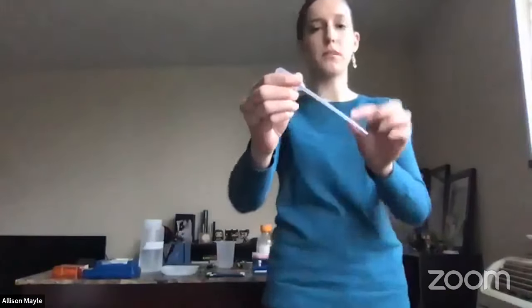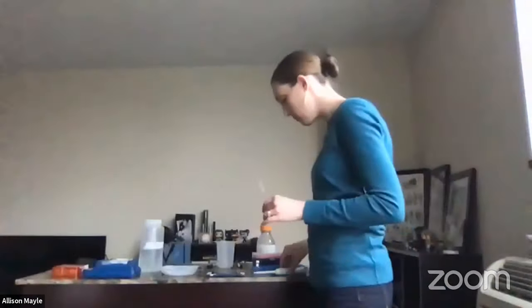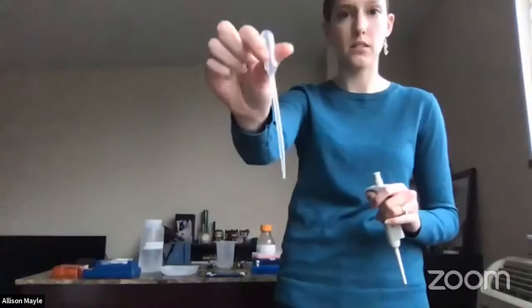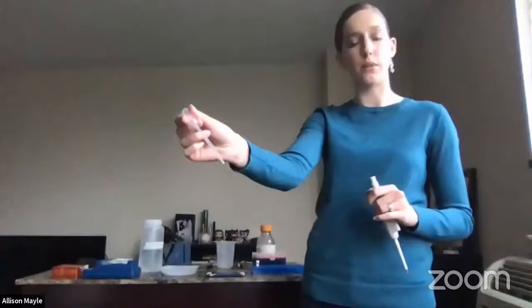Before I talk about the pipette, I want to talk about something like this. All right, so even if you've never used a micropipette, which looks like this, you may have used something like this before. A little dropper pipette, sometimes called a transfer pipette, or some sort of eyedropper.